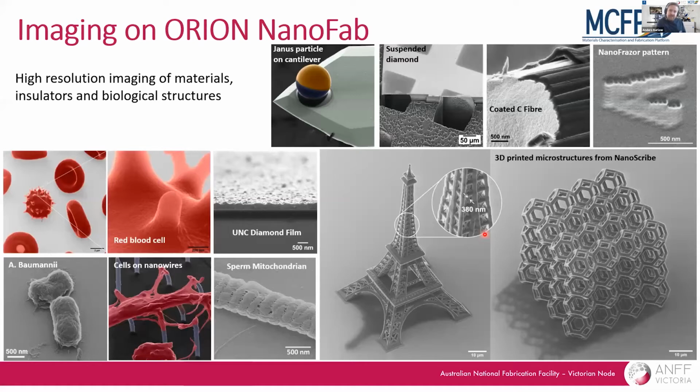So foremost, the helium ion microscope is a microscope, and you can really compare it to the scanning electron microscope. The examples I'm giving you here today are very broad, going from materials into biological structures. But one of the key things I want to highlight is that because we're now using a helium ion beam instead of an electron beam, we can get away with doing things without conductive coatings, for example. And we typically get better spatial, but very importantly, better surface sensitivity with this technique than you will with an SEM.